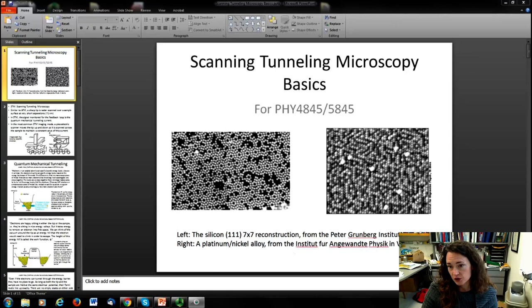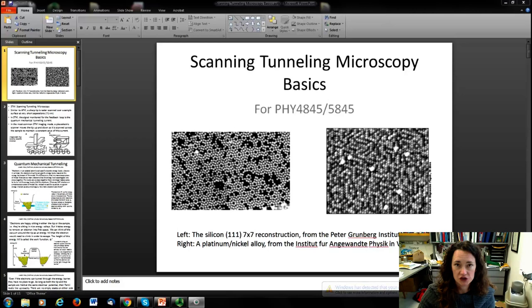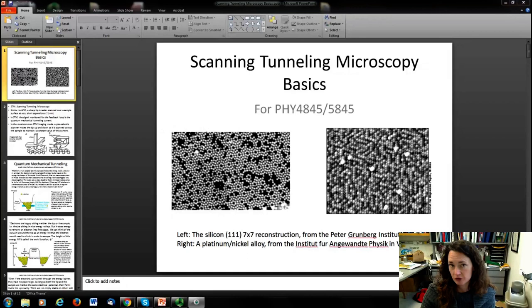Here on the right, this is a platinum-nickel alloy. In this one, you can see that the platinum and nickel appear at different levels of gray — some atoms appear brighter than others. You also see point defects with larger features on the surface. So you're getting true atomic resolution in each of these images using scanning tunneling microscopy.